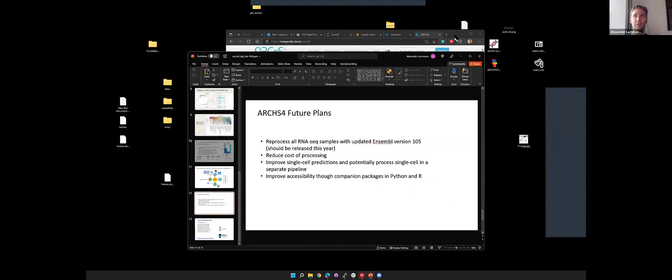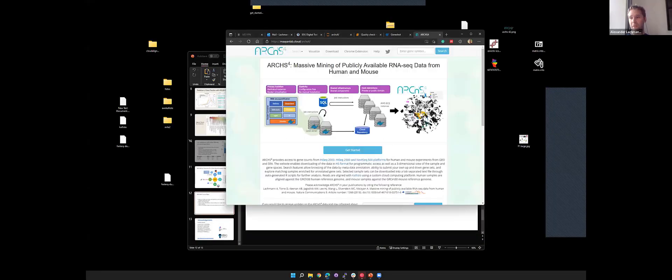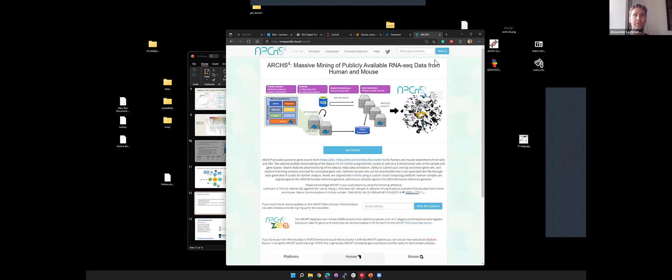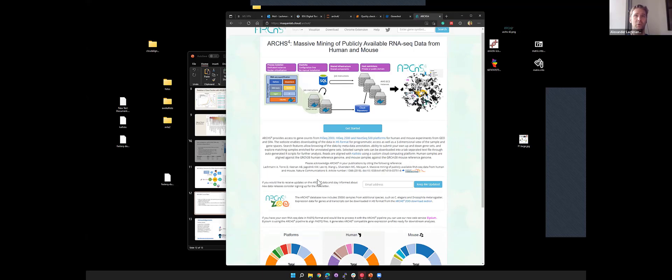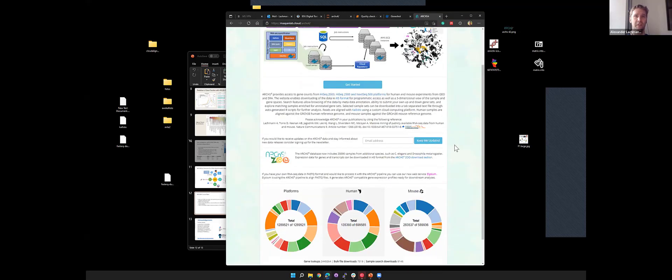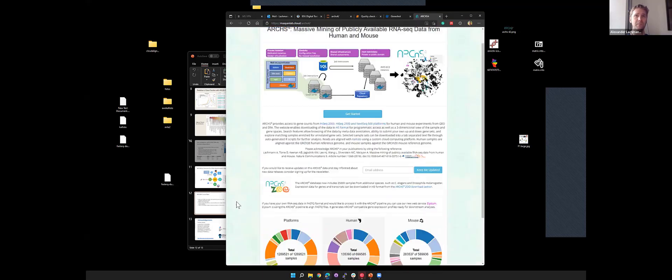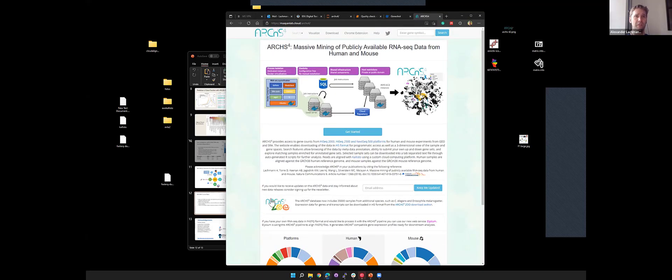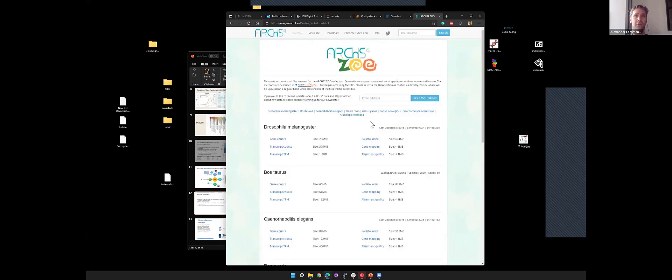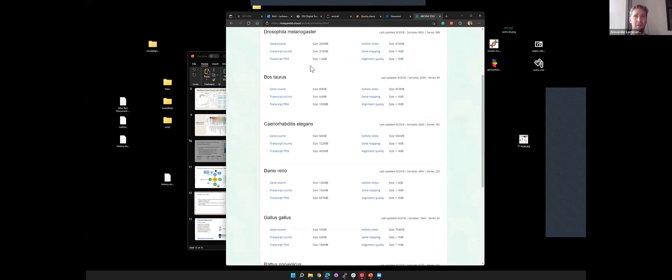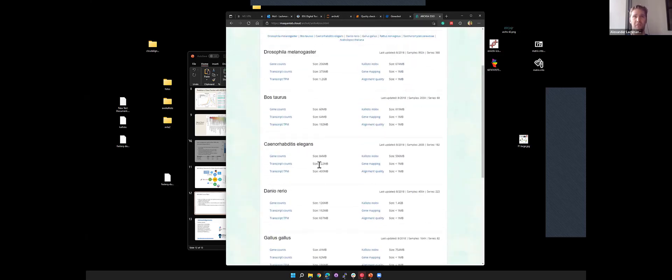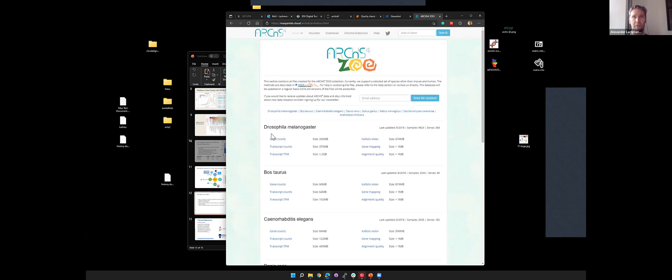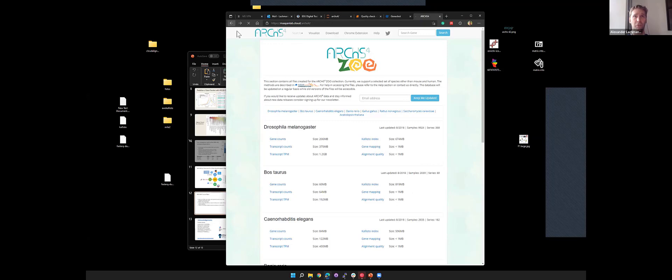Let me go to the website. This is the landing page of ARCHES-4. It's just showing the workflow I showed you before. We have the statistics. This is the ARCHES-4 Zoo, which contains the other species. This is just supporting downloads of the bulk files. We'll probably update this in the future.